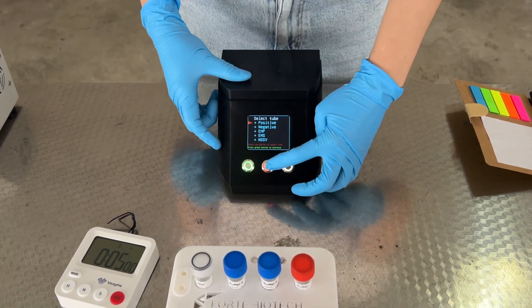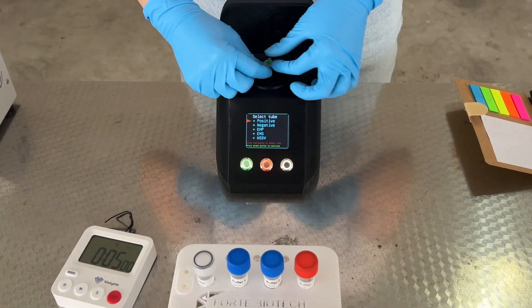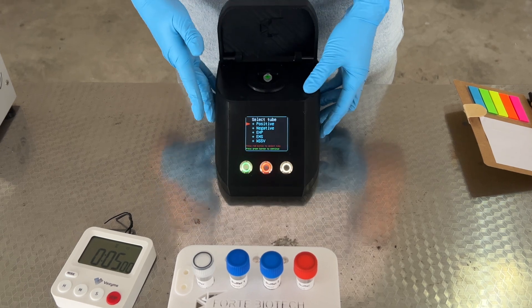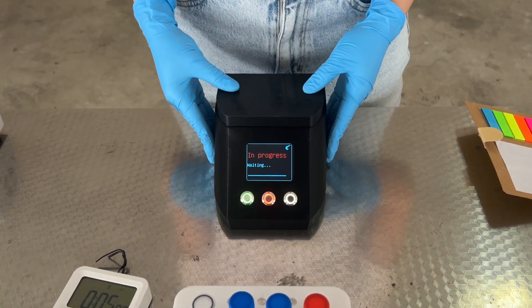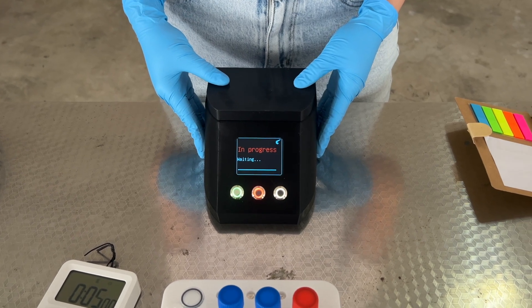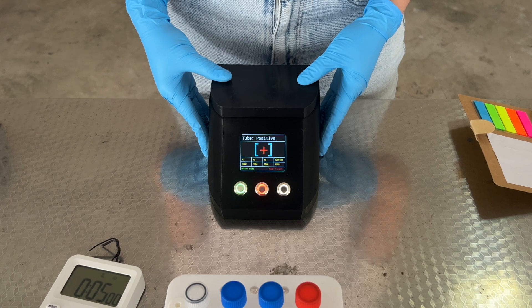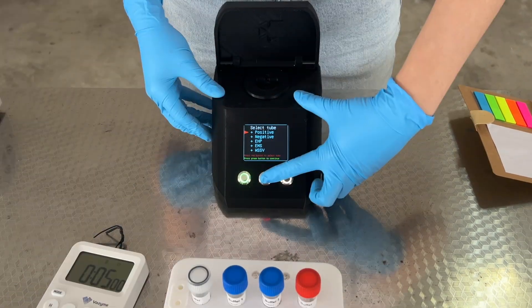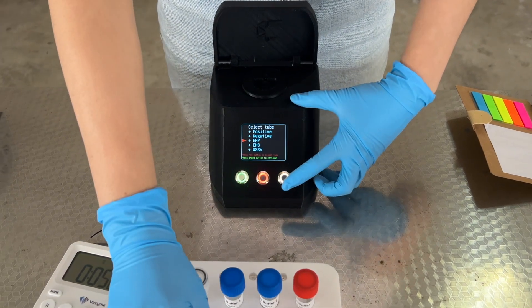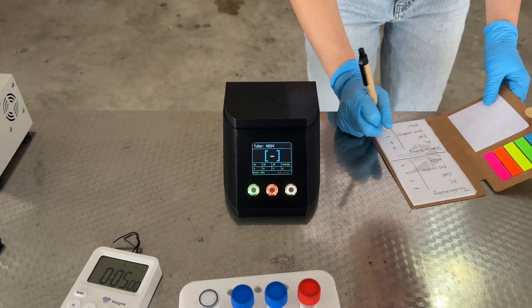Press the red button to select the disease to be tested. Place the respective tube into the reader with the latch fit into the hinge, then press the green button to continue. Press the red button to take the result. Make sure the lid is closed completely during the reading. The screen will indicate a positive or negative result. Repeat this for all tubes. Note down the results.